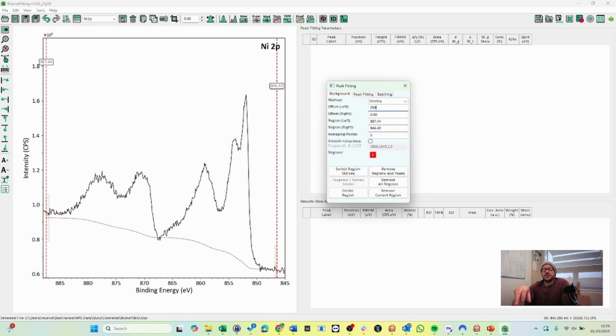This is a particularly useful option if you've got data that's been recorded and you have something like an overlapping peak, and further down you've got a bit of a rising spectra that you can't account for in other ways. So you can stick in an offset and move your background down so that it ignores any peak overlaps, which we'll try and find an example of in a bit. But nevertheless, this isn't a great way of compensating for the background rising above your spectra here.